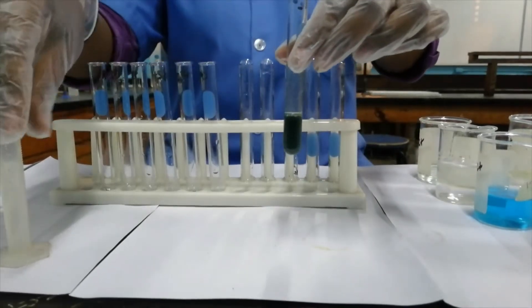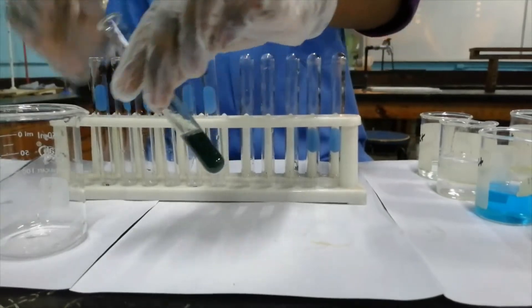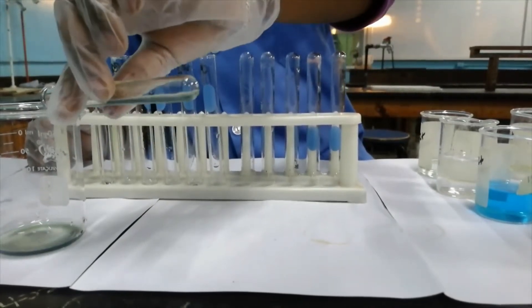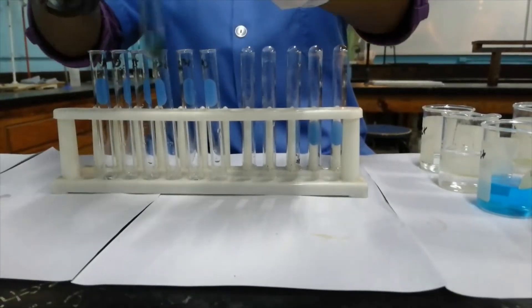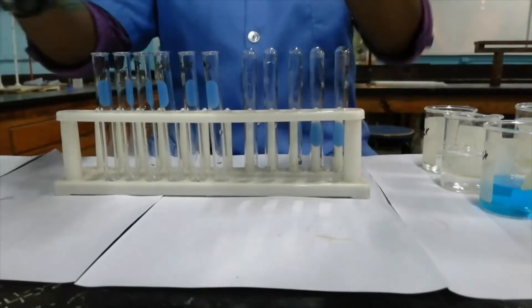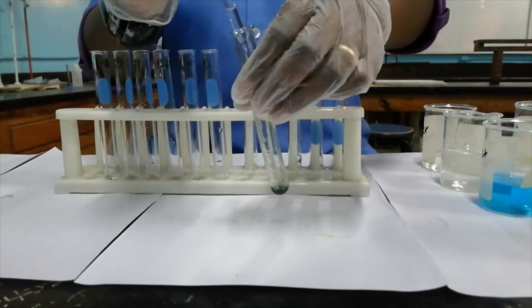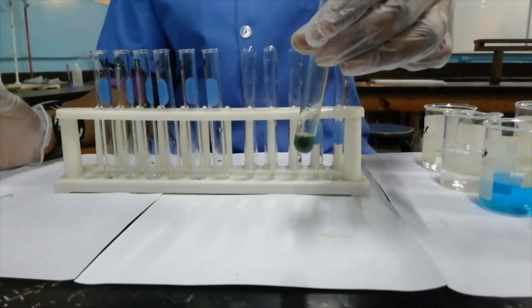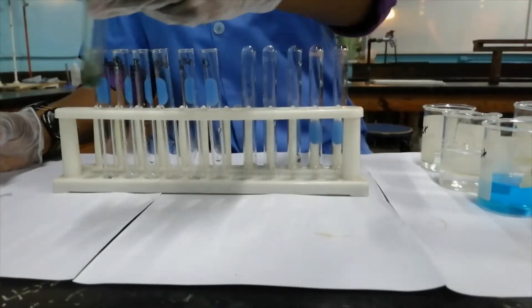It's thoroughly mixed now. I'm going to pour off the majority of this so that we can test if it is soluble in excess sodium hydroxide. When I add excess sodium hydroxide solution, the precipitate remains — that is, it is insoluble in excess.